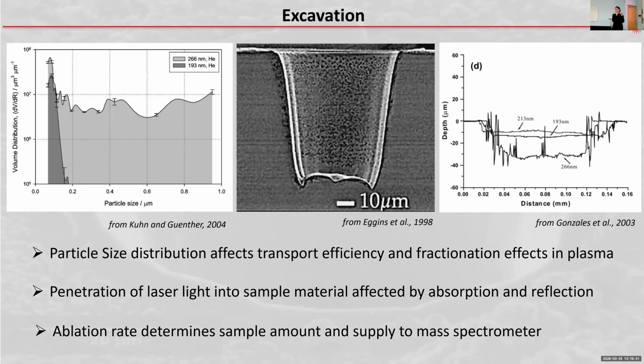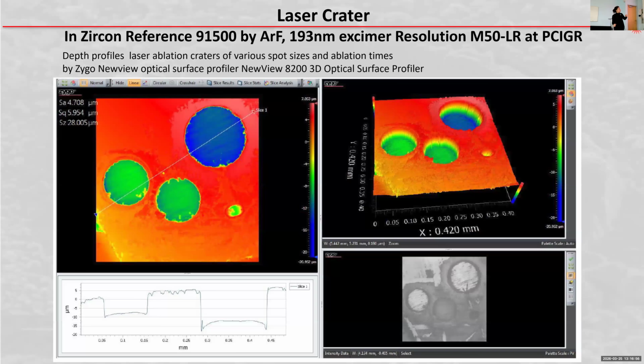On top of the internal pulsation of the laser, you can give it a certain frequency, and hence adjust it according to your sample. The softer the sample, or the more prone to melting, you can increase or reduce the heat effect of it.